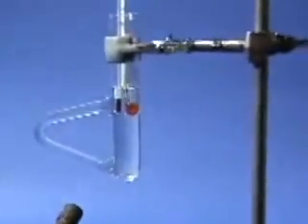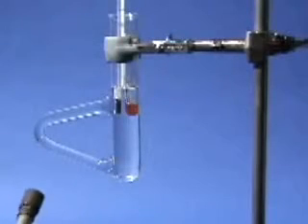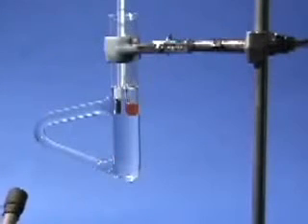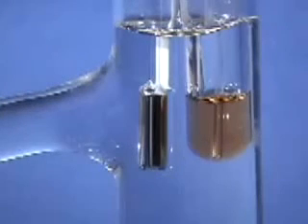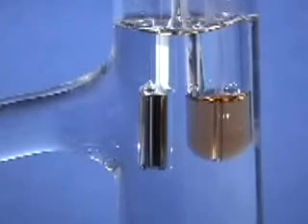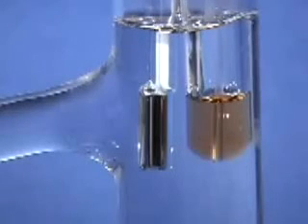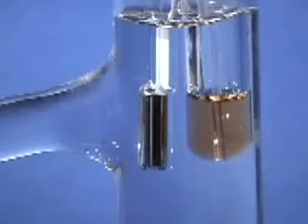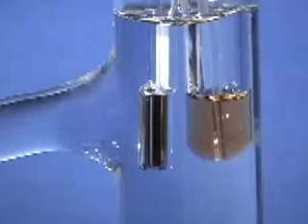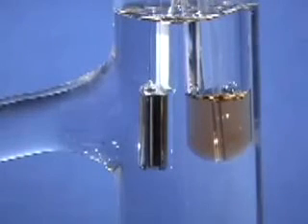Heating of the Thiel tube should not be rapid. Continually fan a blue Bunsen burner flame along the bottom length of the side arm. As the oil and contents of the test tube begin to heat up, one will first observe a short stream of bubbles emerging from the bottom of the capillary tube. This is due to the expansion of the air that was initially trapped in the capillary.